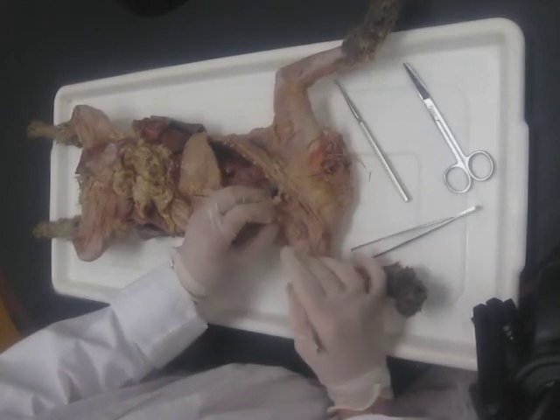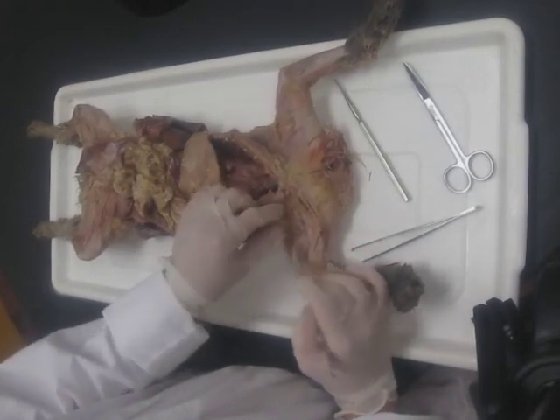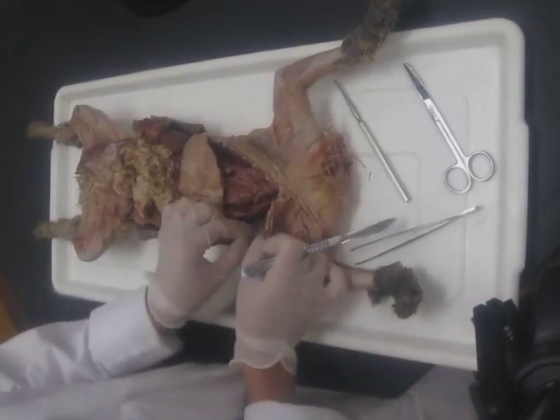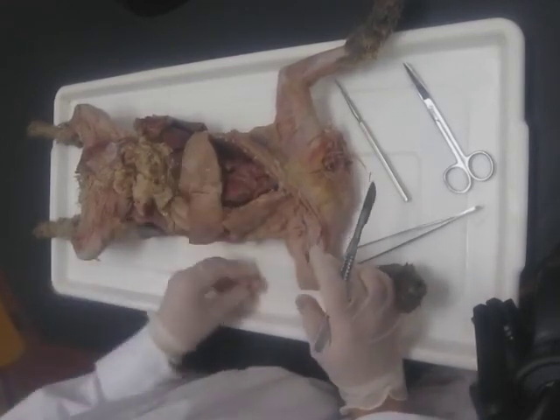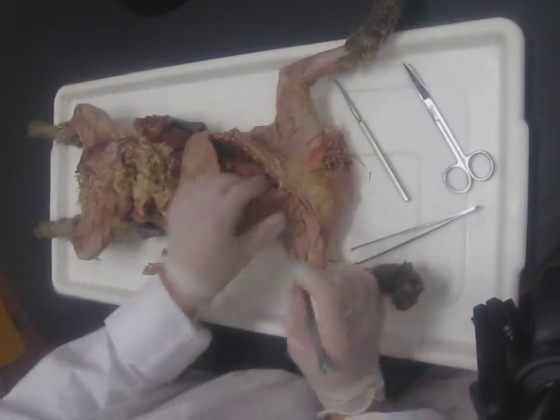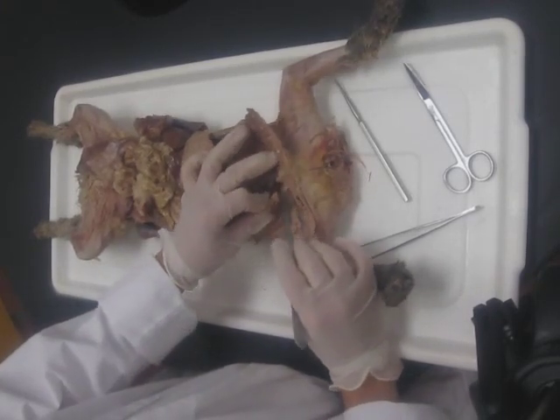If you have any particularly large ribs sticking up through your dissection area, just let me know and I'll come around with the bone cutters and cut them for you. As you remove muscle, feel free to take that away so it's out of your dissection area.